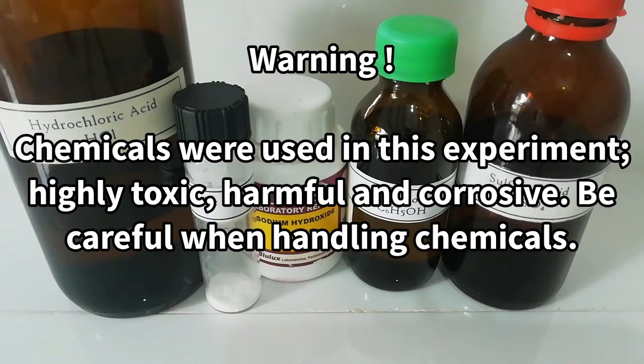Warning! Sodium hydroxide, concentrated hydrochloric acid, and concentrated sulfuric acid are corrosive. Phenol is harmful.